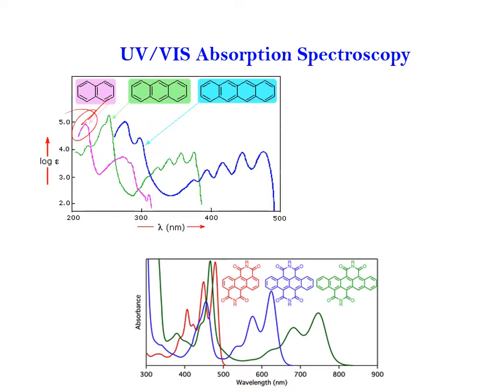High absorption occurs at lower wavelengths for this specific molecule. For the other molecule, the maximum absorption occurs at this region. So like I said, every molecule has its own absorption frequency or absorption wavelengths, and that helps us identify its existence in the sample. These are different absorption spectra for different molecules.